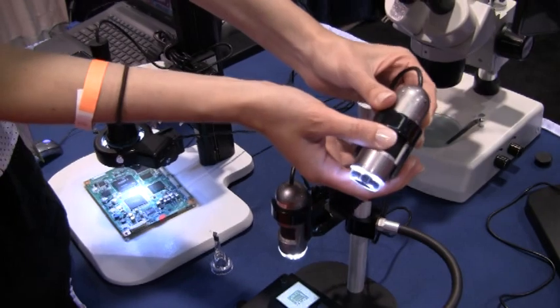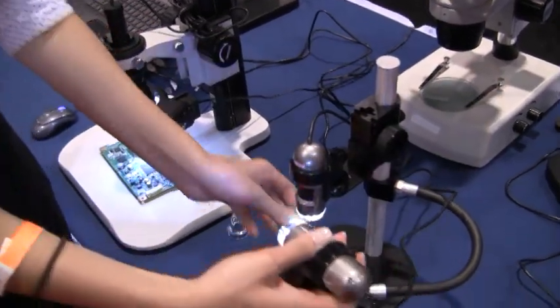There's a lens inside that you're actually moving with your thumb here. You can work really close to your subject.